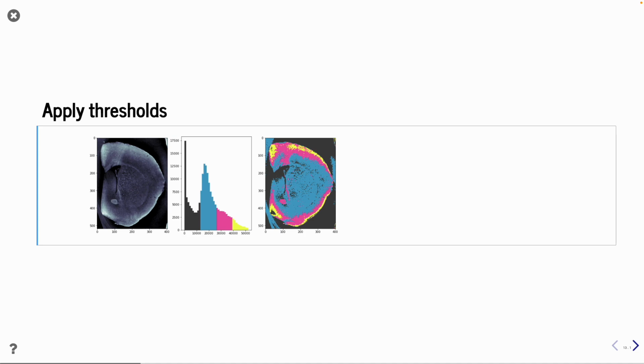The first approach would be just to apply a different threshold, as we have done before. Just this one, I think, is uniformly distributed, just putting a threshold on different gray levels. And the output is not really convincing. We can see in this segmentation that we have a gradient in the image, that it's brighter at the border and darker in the middle.